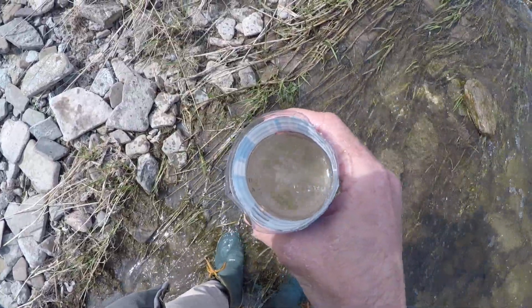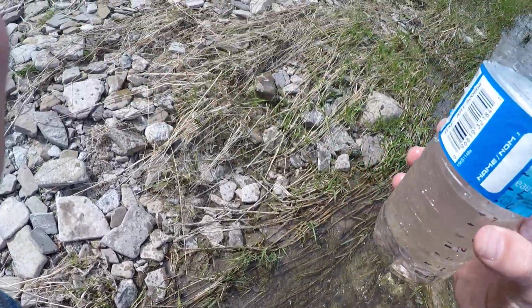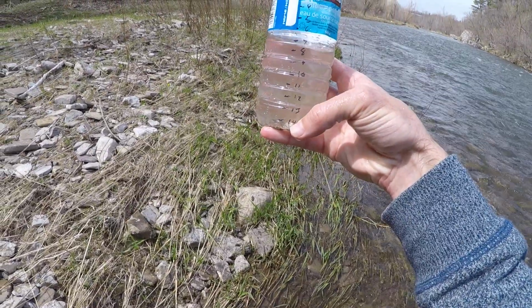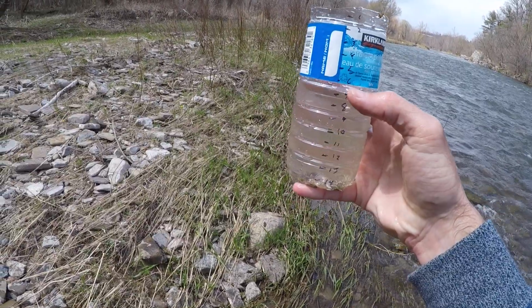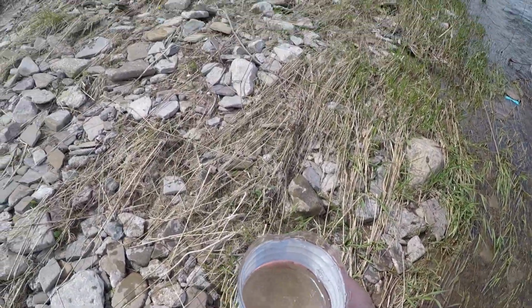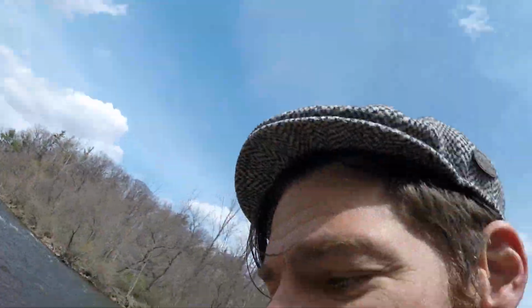Pour a little out. I can see it. You can probably see it too. So there, I'll take my measurement. I did it backwards, so you want to start your measurement as 1, 2, 3, 4. But either way, 14, 7 is halfway, so it's 7 centimeters. I can start to see the bottom, and that will be our measurement for turbidity.